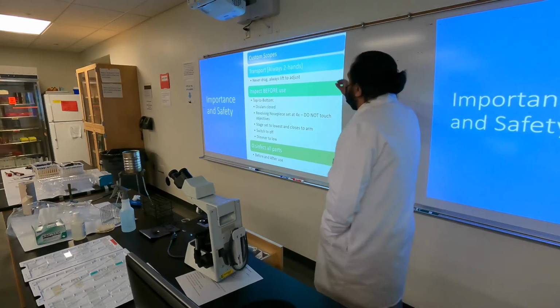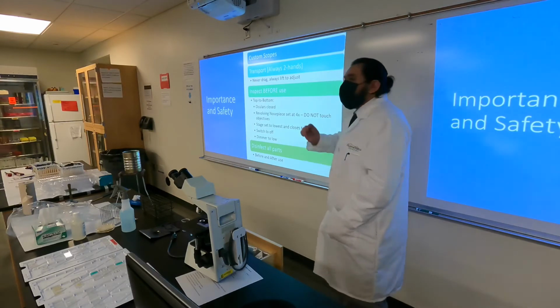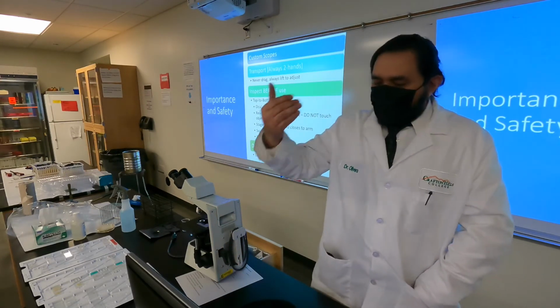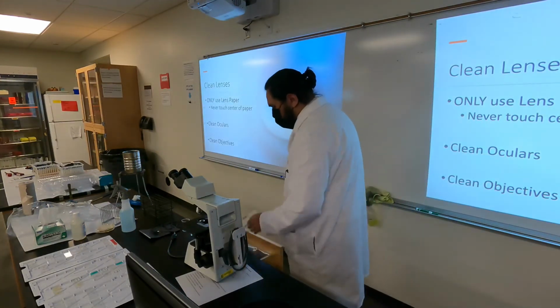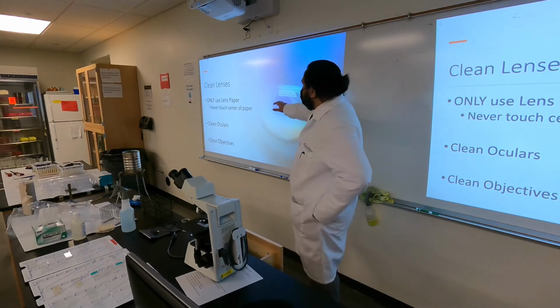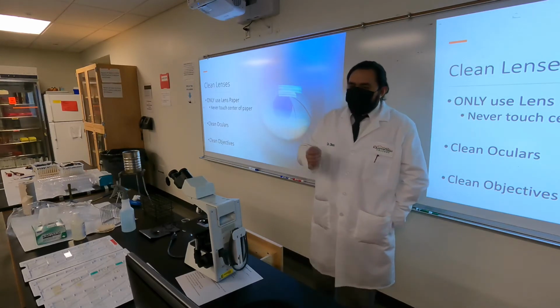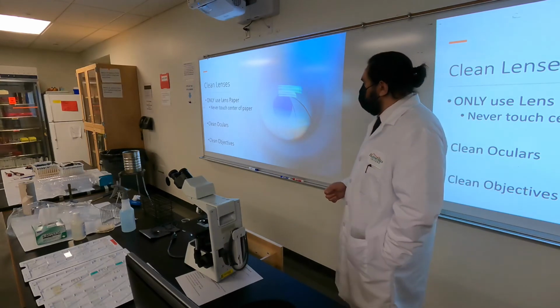So we did the anatomy, we did the inspection. You should have disinfected these with the little chamois to make sure that it's nice and clean. Again, always before, always after. And then we're going to use our lens paper, depending on if it comes in the large versions or the little small strips, making sure that, again, you're cleaning both of the oculars and the 4 objectives gently but thoroughly to make sure that there's no oil, and making sure you can see clearly through them.